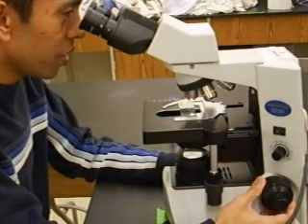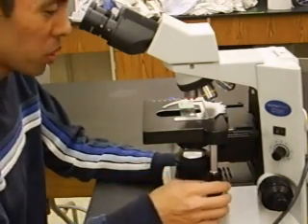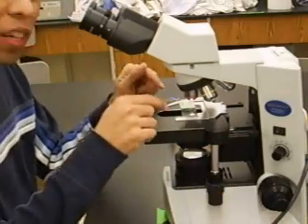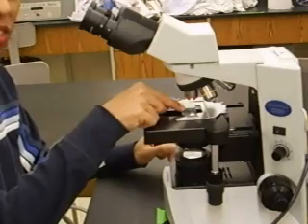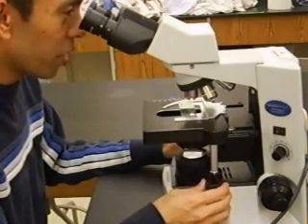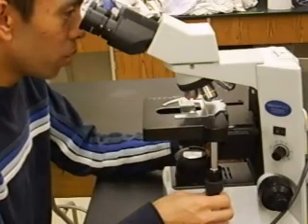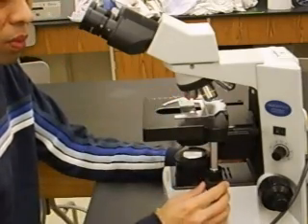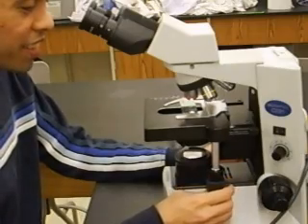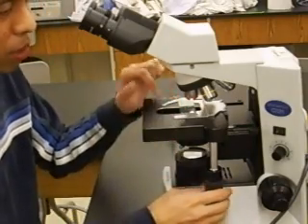When you see something come into focus, a useful trick is to turn the stage movement knobs to move the specimen from side to side. If you're looking at something actually on the slide, it should move with the slide. If what you're focused on doesn't move at all, that's an indication you may be looking at debris on the objective lens itself, not the specimen on the slide.